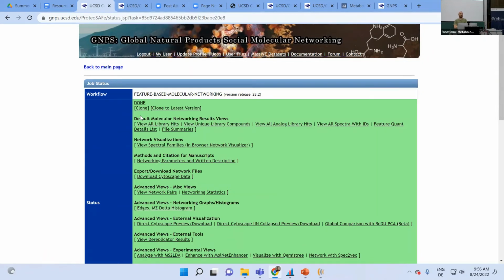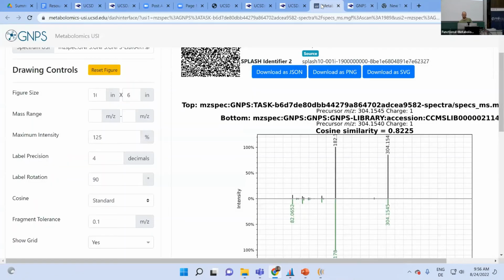Yeah. In fact, I would actually put all the mirror plots of molecules discussed in the main text into the SI, right? Be transparent. Or with the USI, you can even share the URL. So with the GNPS dashboard too, which we're gonna highlight later, because this is all in the cloud, you know, it's accessible.